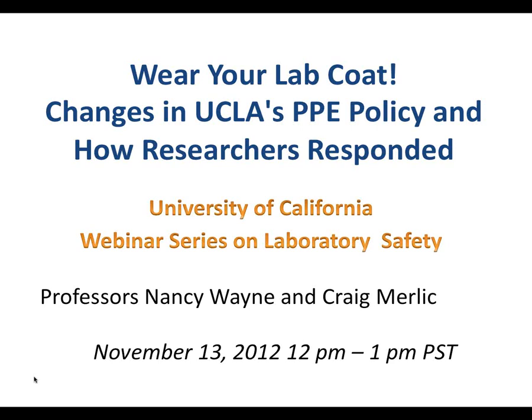the PIs and researchers. And this was something that was directed training of the inspectors and how to interact with querulous PIs, let's say. Not every PI is nice and sweet like Craig and I are when we have an inspector come into the lab. And so our inspectors are being taught to be respectful when they come into the laboratory. You're coming into someone's home away from home. To use the inspection as a teachable moment or a prolonged teachable moment.